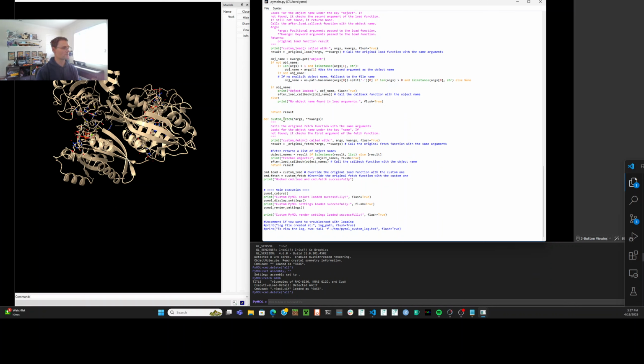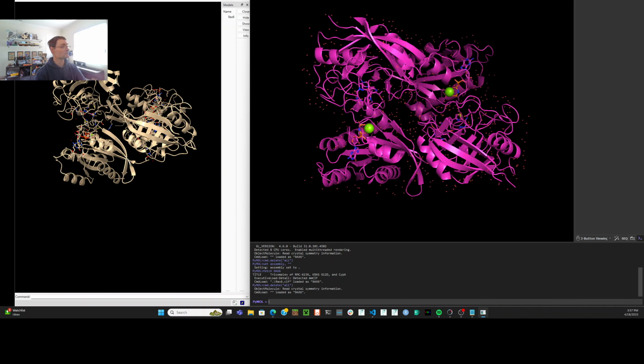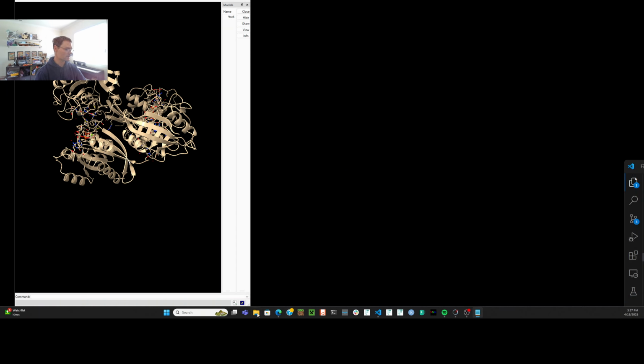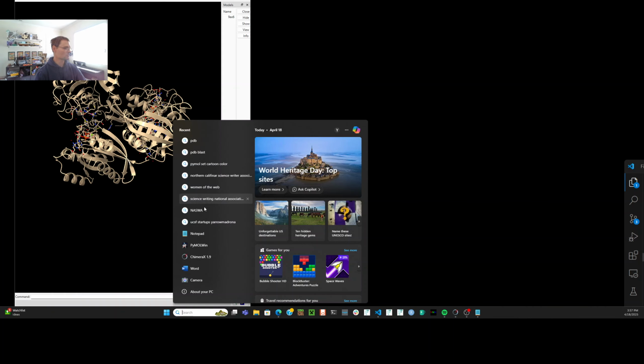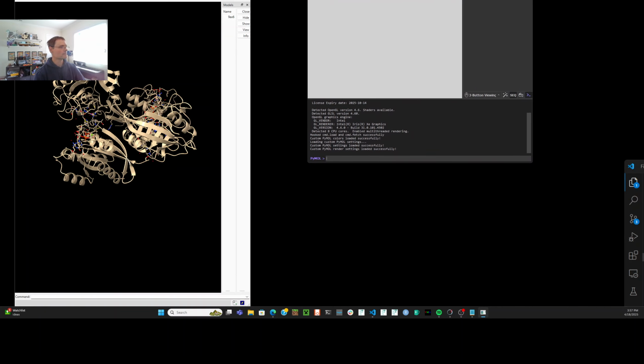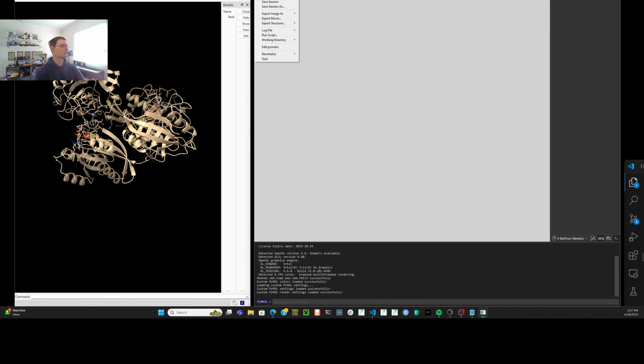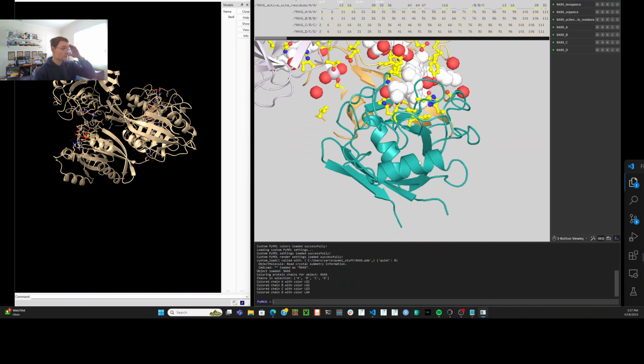And we can also do this with the fetch command. And after we save this, you're going to see that it looks a lot better. We have to open Pymol again because it's a startup script. We'll open it again. And you see it's already working because the background is gray. And we're going to open recent PDB. And what we notice right away is it looks a lot better.